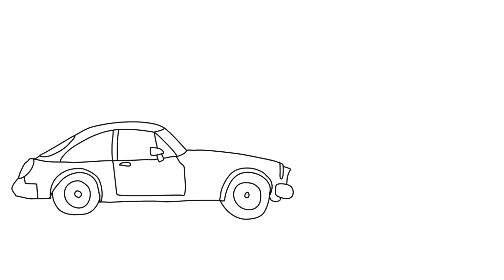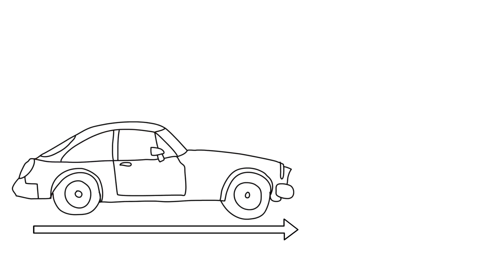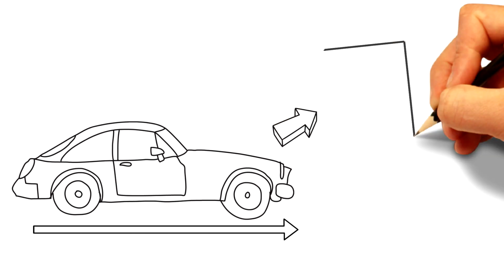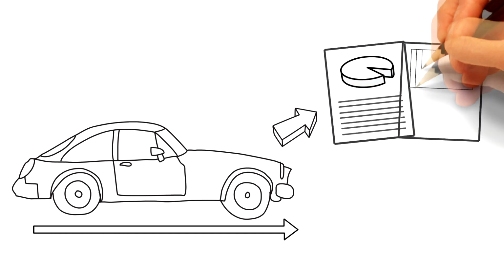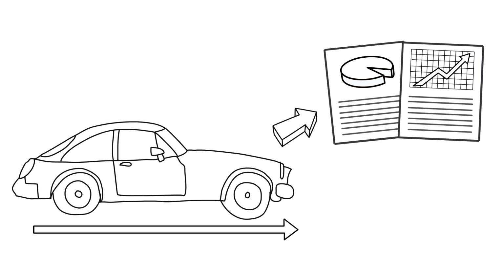Let's take an example of how to improve tire performance. In the lab, researchers are investigating how additives can alter the surface structure and influence their compatibility. By using IGC, you can discern the interaction between the particle surface and the matrix, which assists in the design of a longer-lasting tire with reduced drag, making a car much more efficient.